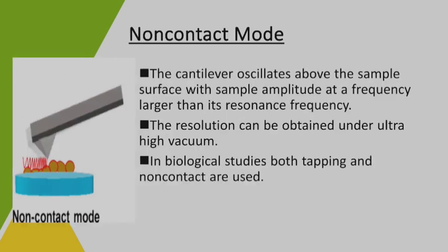And the third mode is non-contact mode. As the name suggests, the cantilever tip will not touch the surface of the sample, but it will scan just above the surface of the sample. The cantilever oscillates above the sample surface, but it will not touch the sample. The resolution can be obtained under ultra high vacuum.